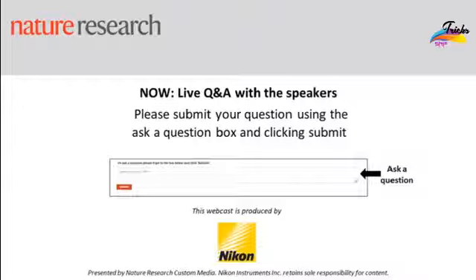So the next question we have is for you. It's on how organoids get infected. The question asks, when the infection is on the apical side, which is obviously the organoid model, how does the virus enter the mini-gut lumen?